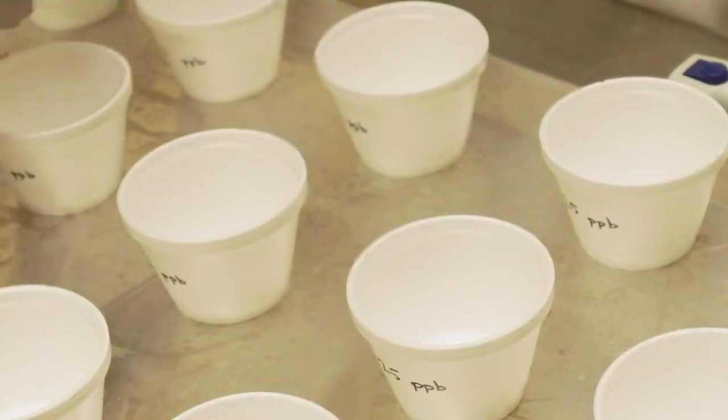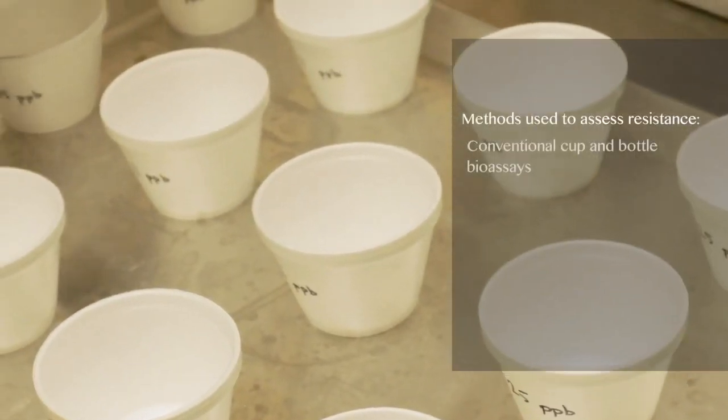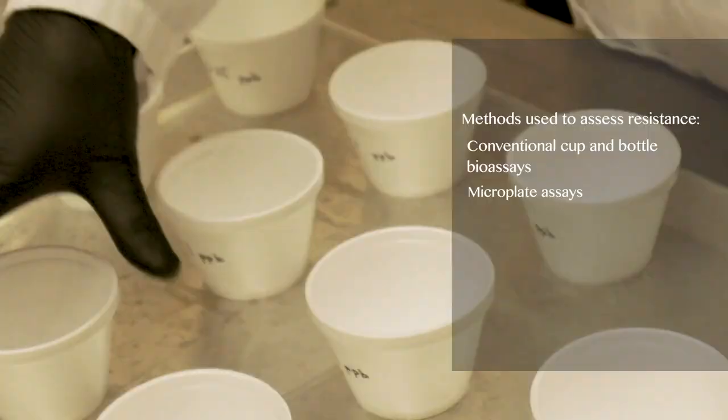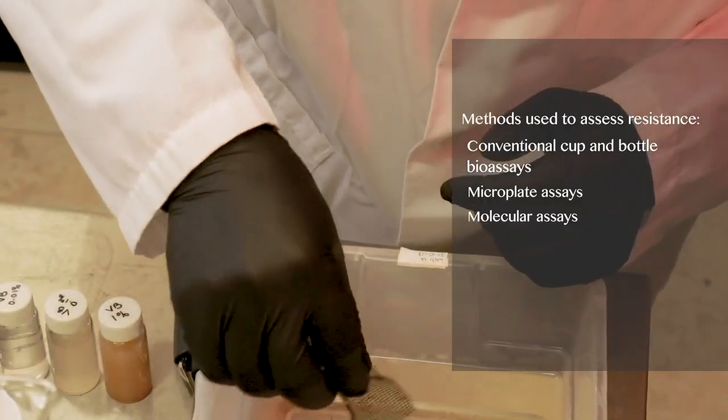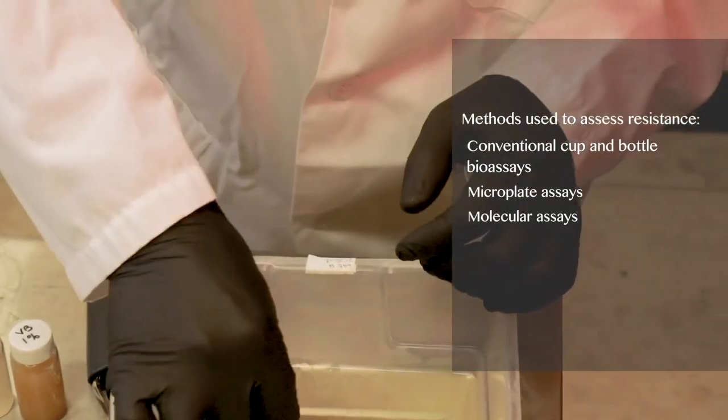The methods used to assess resistance include conventional cup and bottle bioassays, microplate assays, and molecular assays. The standard laboratory bioassay, when coupled with biochemical or molecular studies, can help determine the mechanism of resistance.